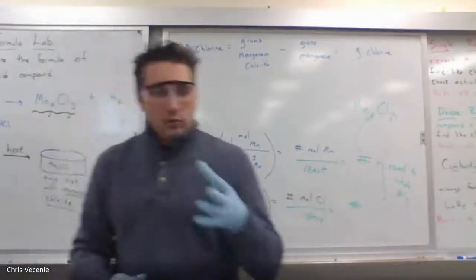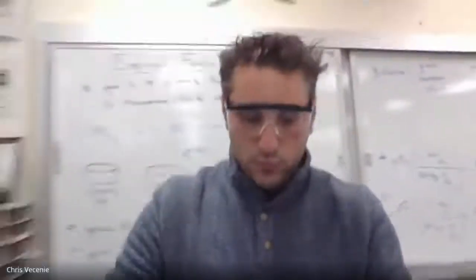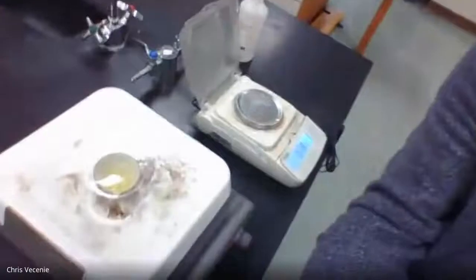All right, so we're going to take a look in the back, see how our evaporating process is going. All right, if it's done, we'll go ahead and get a mass, but it's kind of early for that to happen. If it's not done, what you guys can do, right, is the few star calcs that you're able to, and you can start working on some PostLab stuff. So if you take a look, still liquid in there. All right, we got to let that keep going.